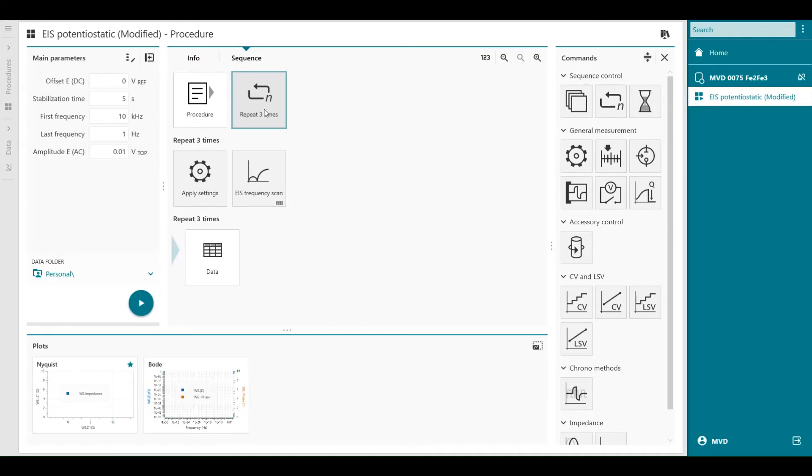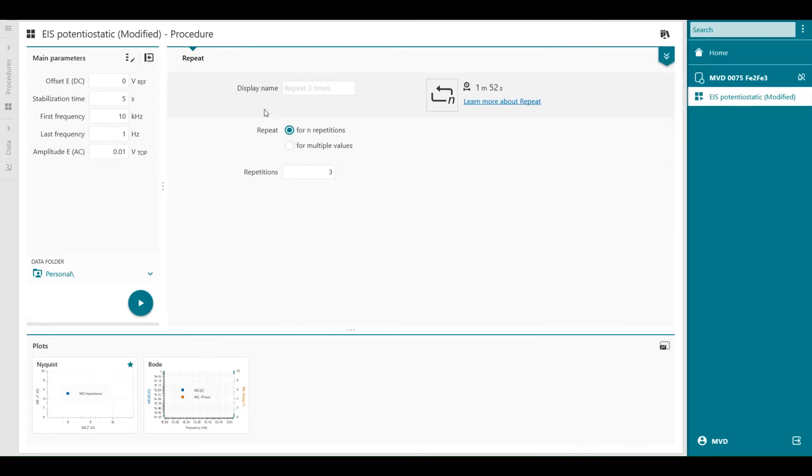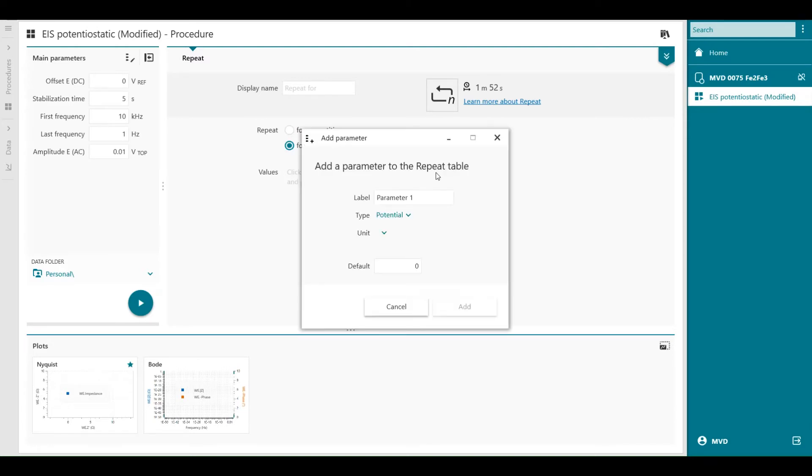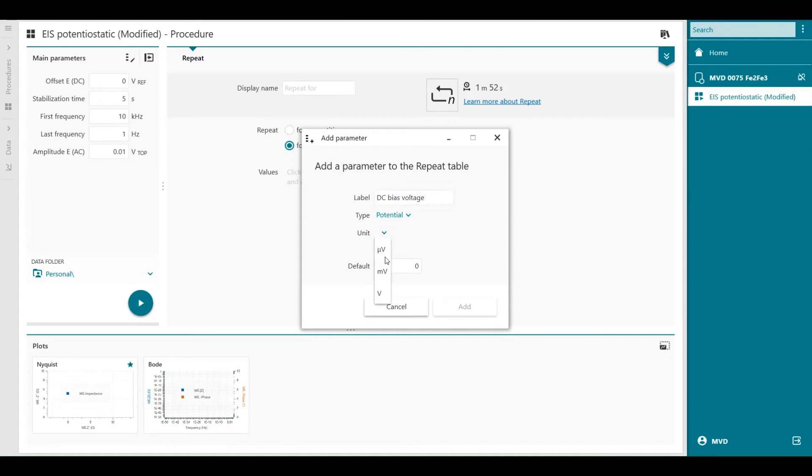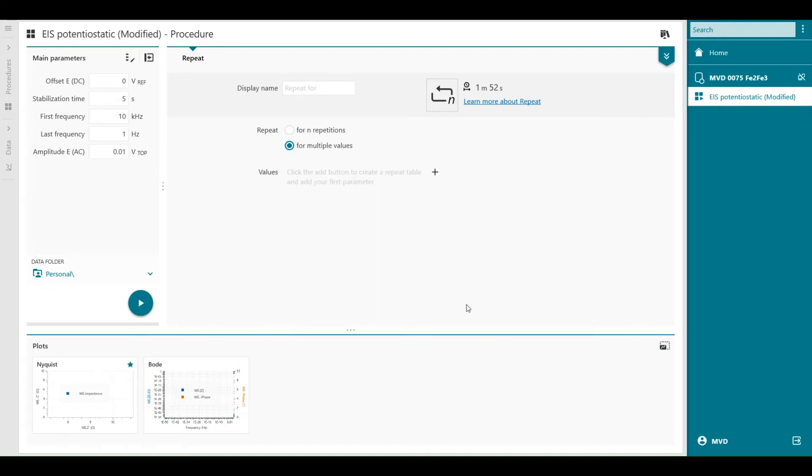Then we're going to create a table in the repeat loop for multiple values. We press this plus button add new parameter column and the first parameter we're going to add is DC bias voltage. It's potential in volts. Press add and then we can generate a value.